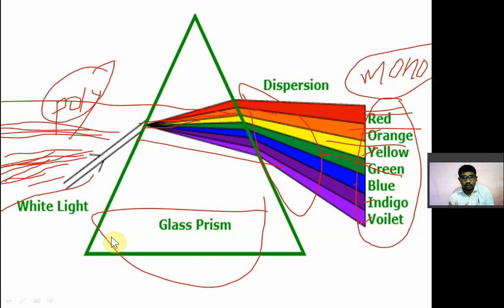Okay, so because of that, the dispersion is produced by the light, water and light होता है simultaneously. उसमें क्या है, it will act like a prism. और उसमें से अगर sunlight आता है, so that sunlight will be dispersed into a rainbow. At that time that acts as a prism. So polychromatic light will be converted to monochromatic light by the prism.